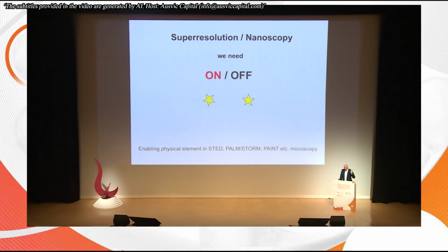Now, I could say I've done my job and do something else, but there's one thing that really bothered me, I must say. I said it many, many times. The key physical enabling element of STED, PALM, STORM, PAINT, and the rest is on-off. You separate by making sure that not both are on at the same time, or 5 or 6 of them are on at the same time, but only one. And I repeated that hundreds of times in all the talks I've given since 2000 and something.